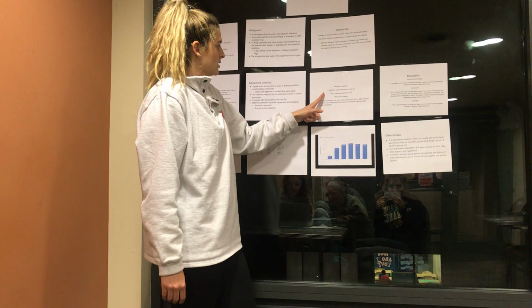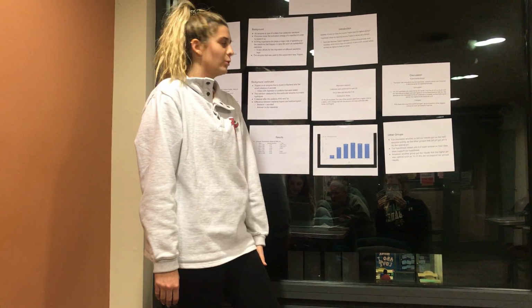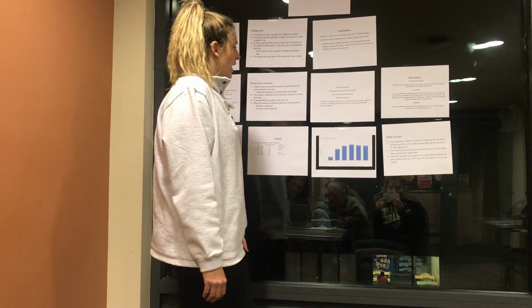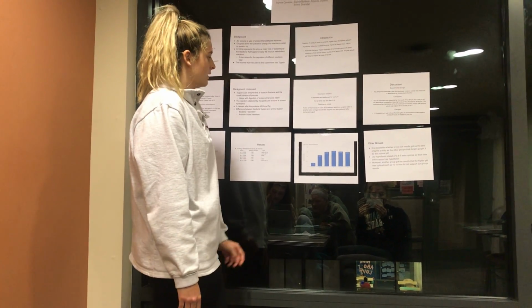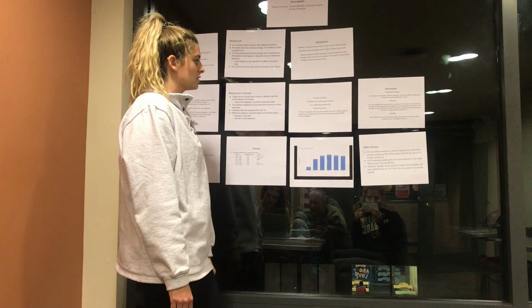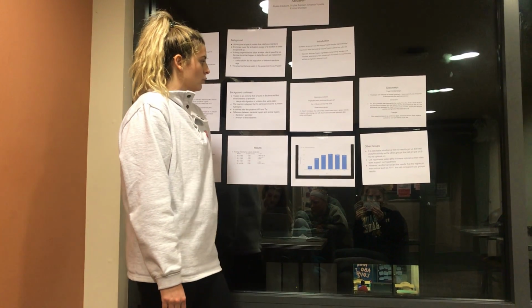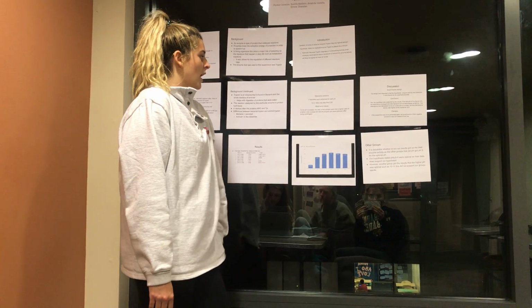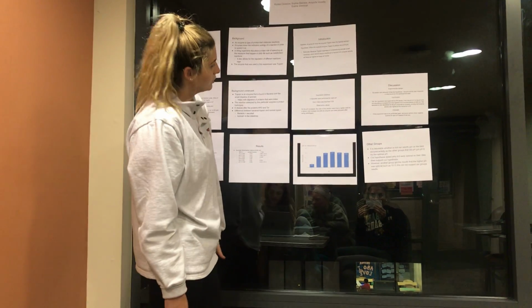For our descriptive statistics, 3 replicates were performed for each pH, and our p-value was less than 0.05. And then for our observations, as the pH increased, the color of the solution went from a lighter color to a darker color, and it was an orange-red with the enzyme. And then all of them were a clear yellowish after being centrifuged.